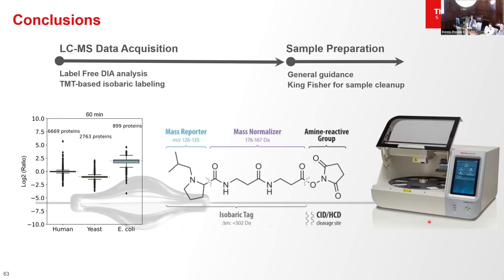I can set up a titration curve and get a true limit of detection and limit of quantitation, like has been done in analytical chemistry for 50 years. You can do that with a peptide, and that's something you really can't do with SOMA or O-Link.